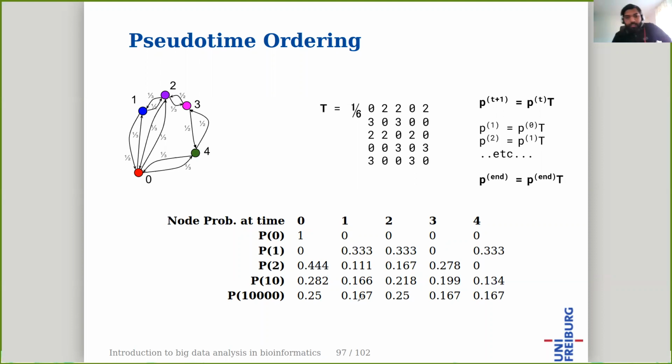Now we start from these cells to order the other ones. So we start from these two and then try to traverse to other cells, and find the next cell which can be traversed fastest, that is, the next one adjacent to this cell. So let's take the example of 0, because this is one of the cells with the highest probability here.